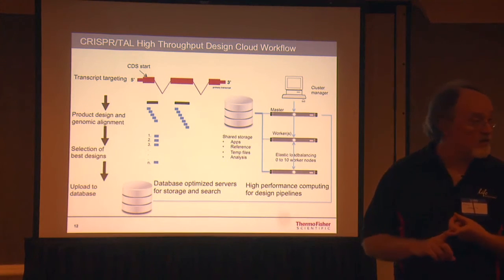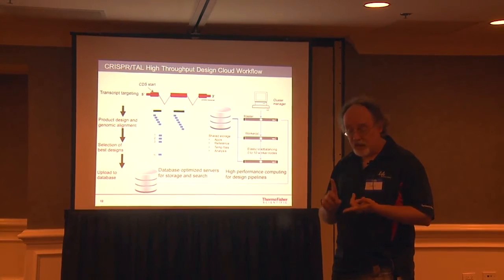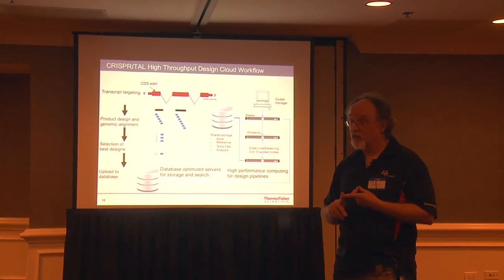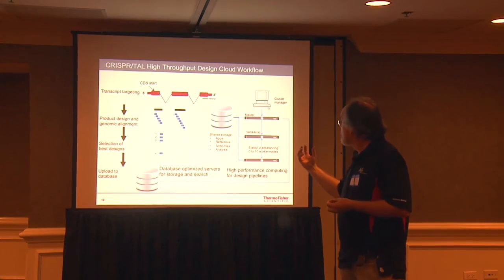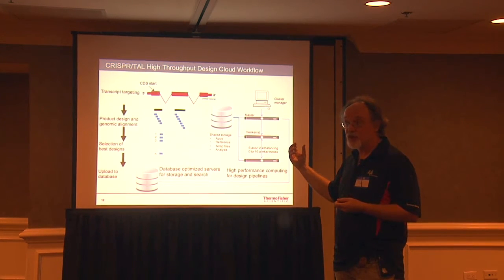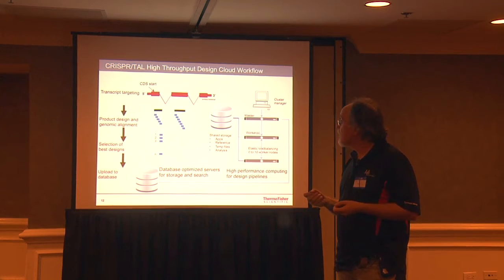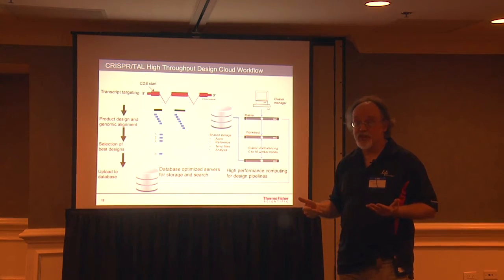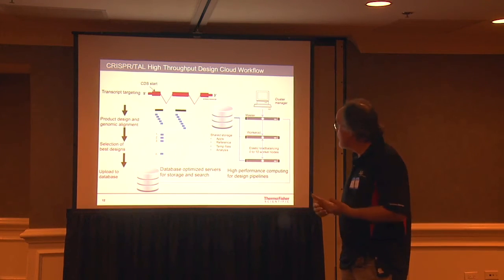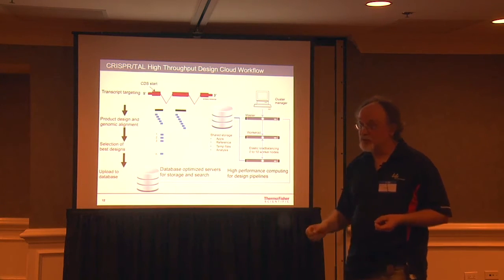We're using open source software as part of our data model for our database. We relied very heavily on things like the UCSC data model and RefSeq data models. We're using software in order to screen against our genome. We're using Burrows-Wheeler transforms, looking at how Bowtie was written, understanding the algorithm, then applying that to our workflows. And for the actual original description of the guide RNAs, we're reading papers which are in scientific journals. We're understanding the criteria for how to select those. And then we're going in and using those criteria specifically against our design needs for our technologies and tools.